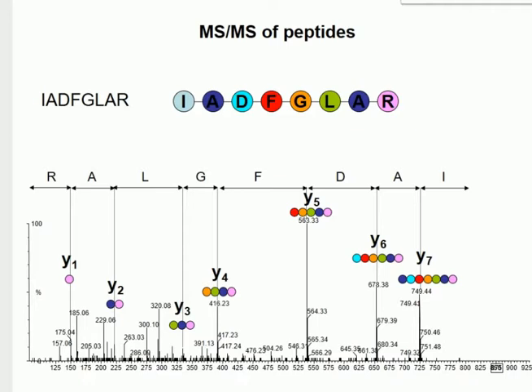So if you have a peptide and it's singly charged, so there's one proton on it, but it's from a trypsin proteolysis, all of the peptides are going to have lysine or arginine at their C terminus. And that will be where the charge goes, because those are the basic amino acid residues. Okay?